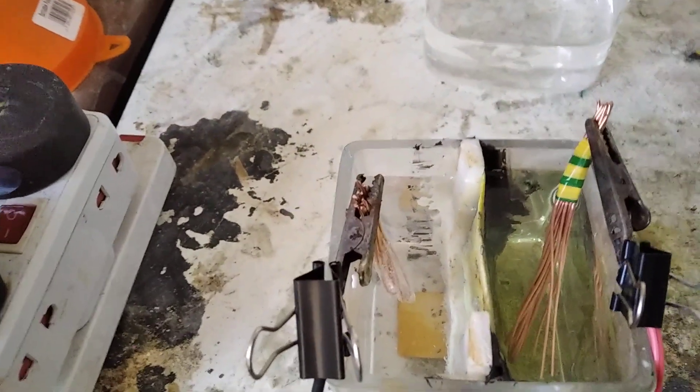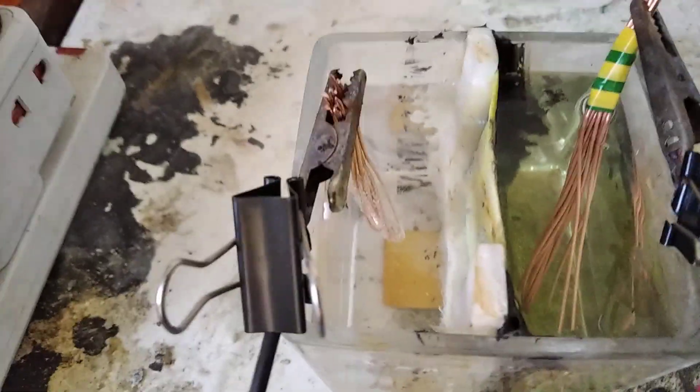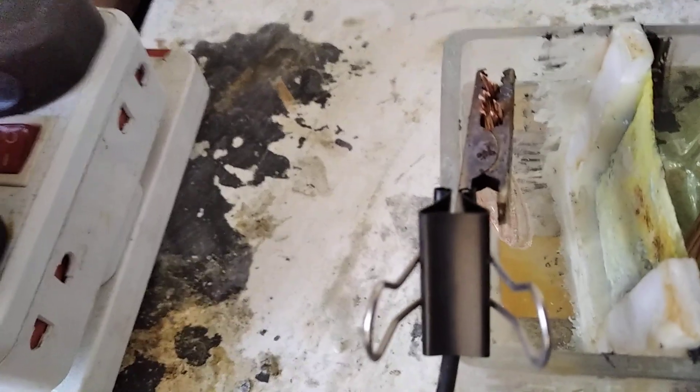For this membrane electrolysis I'm using hydrochloric acid as the electrolyte in the anode chamber, and in the cathode chamber it's just pure water.